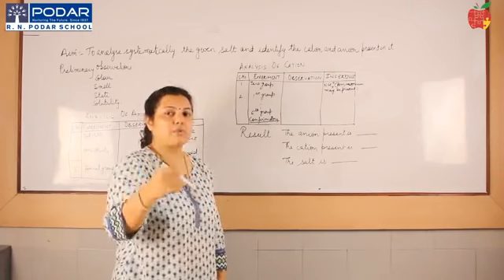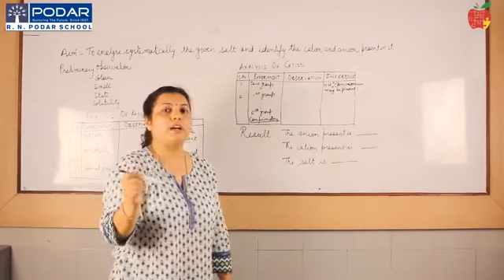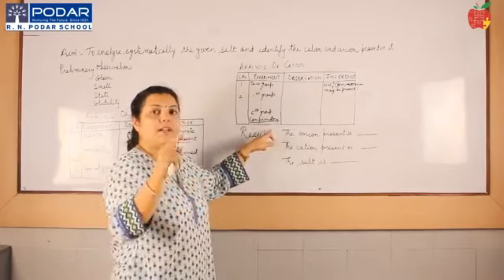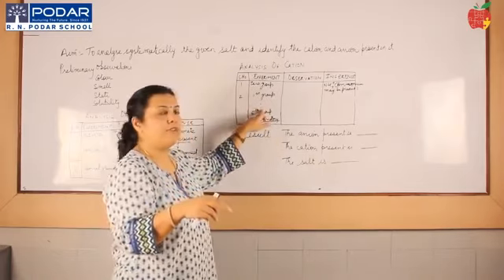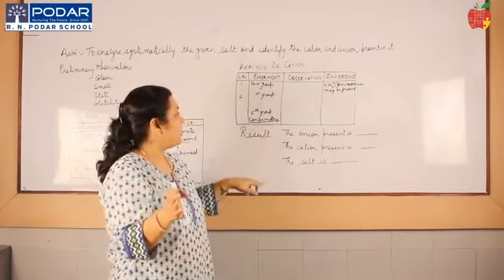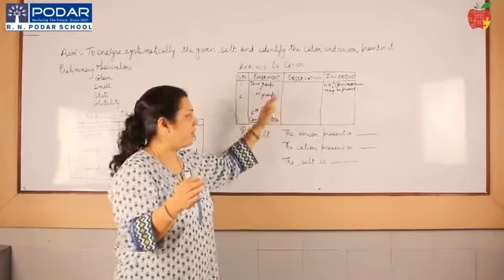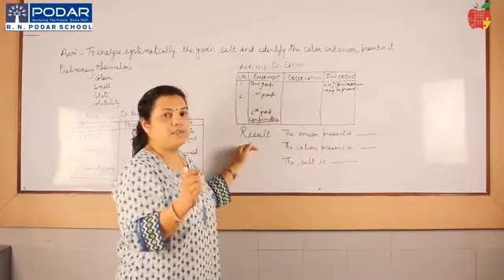For example, if it is cobalt, cobalt is in fourth group. So after that you get a black PPT, then you continue with the confirmatory test of cobalt. If it is barium, then write till the fifth group and then write down the confirmatory test of barium and so on. Once you have analyzed the anion and written it down, analyzed the cation, written it down in this tabular manner, the result is very important.